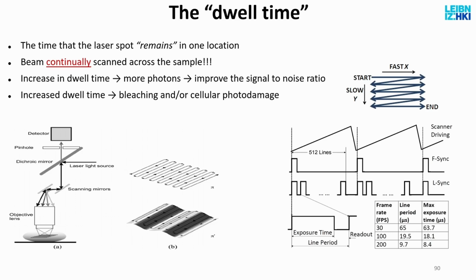If I say 10 microseconds, I generated 5 times fewer pixels. But since I collected light 5 times longer during the scan, I get 5 times as many photons. So the number of pixels that you set on your microscope determines how long you collect the emitted photons during the scan from left to right. The longer you collect, the fewer the number of pixels, but the brighter the image.